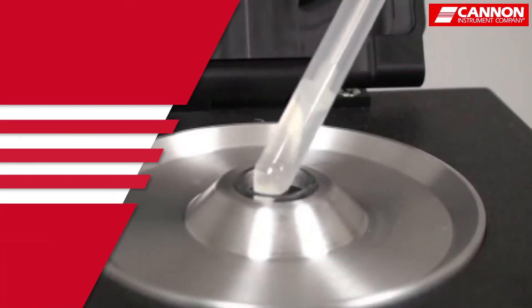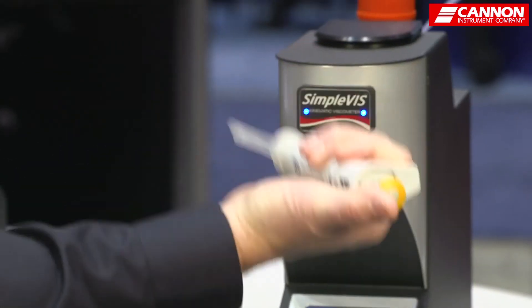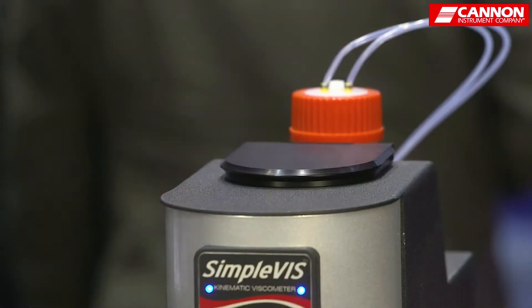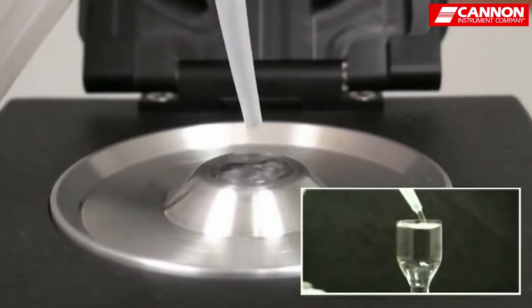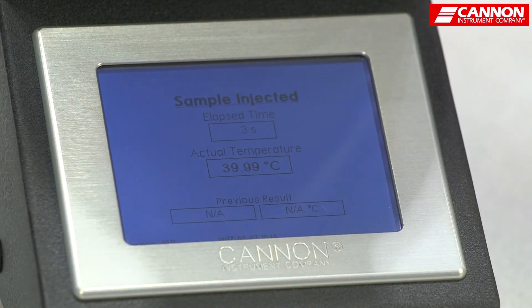We supply a pipetter — 500 microliters — so we would just inject, pull the sample in, lift up the lid. I would inject a sample in the top, close the lid, the oil runs down through the viscometer. It will give me a result, and that's all I have to do.